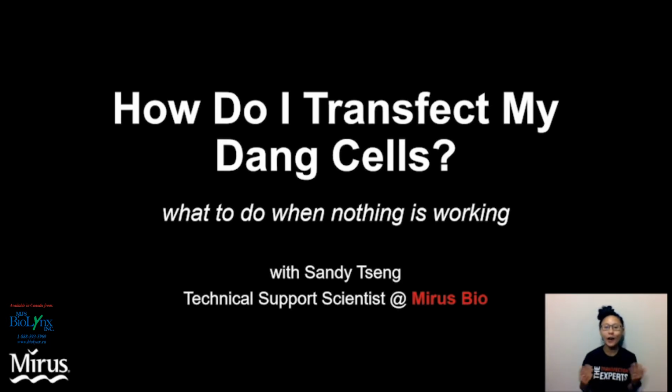Not only how to perform transfection and what it is, but what do you do when your transfections aren't working?